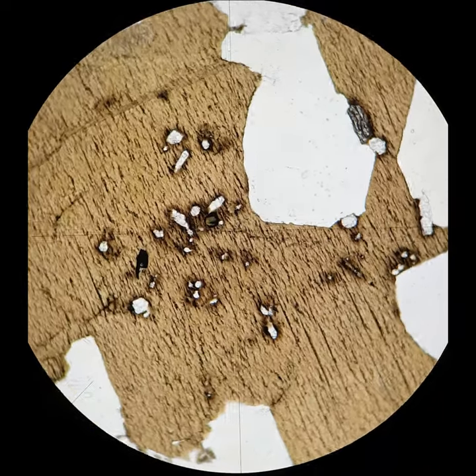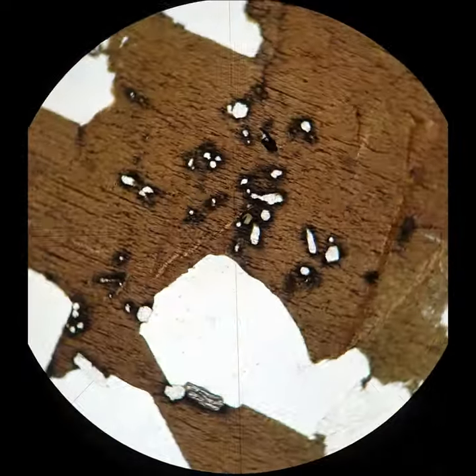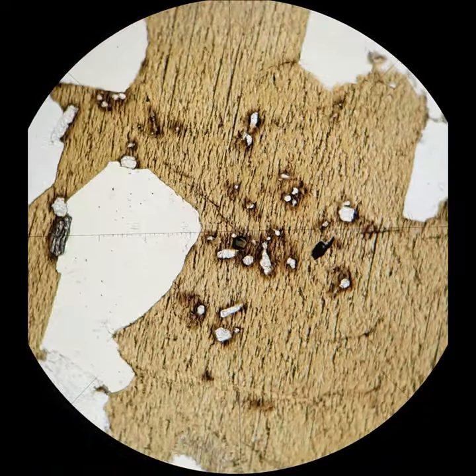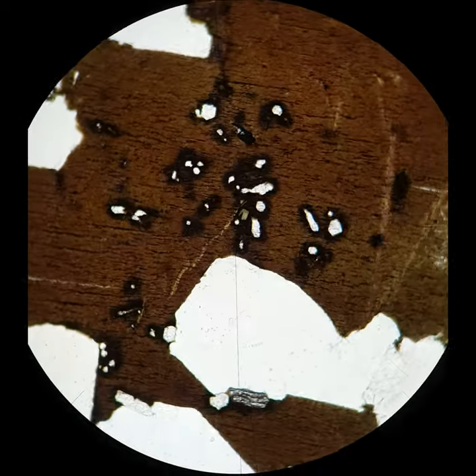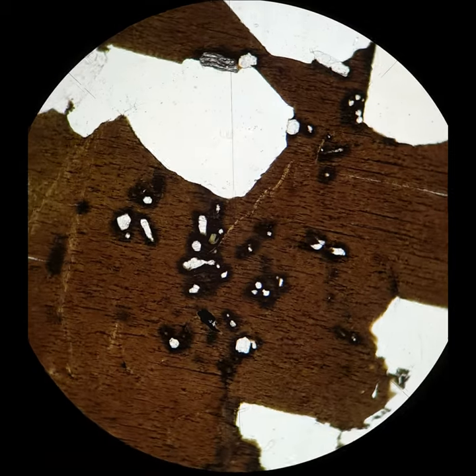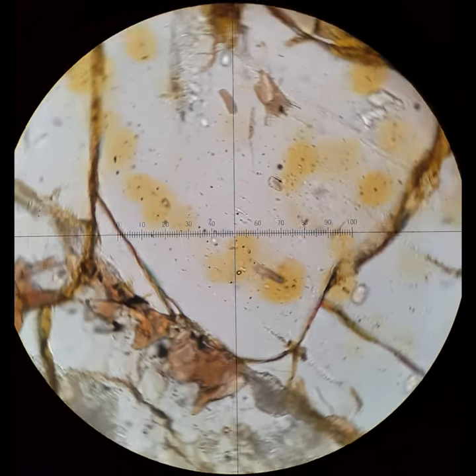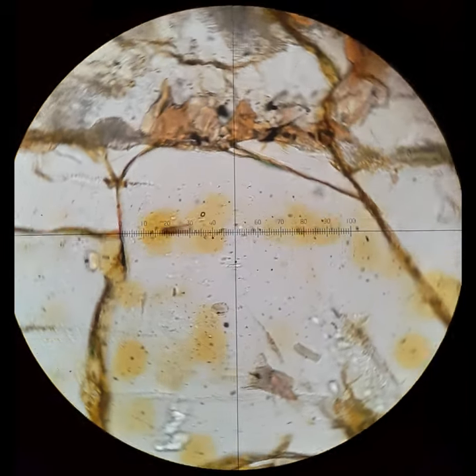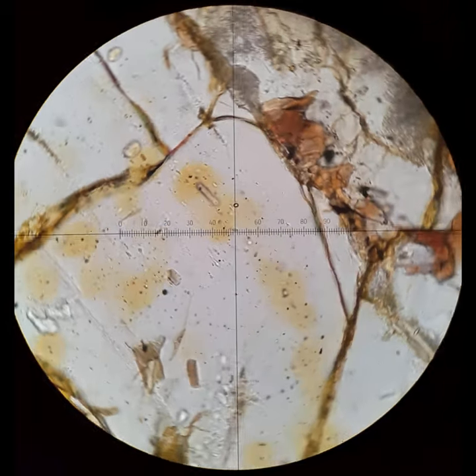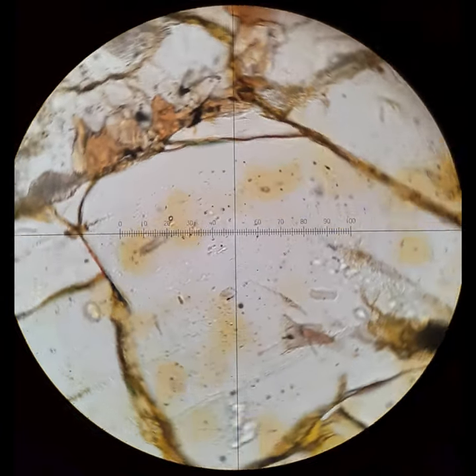Radiation damage in some minerals also causes pleochroic halos. The light dots in there are radioactive minerals. The darker halos around them are the radiation damage, and you can see that they are pleochroic as well — they vary in intensity. These radiation damage halos around radioactive inclusions in cordierite are one of the main ways that I identify this mineral, and these yellow pleochroic halos are especially distinctive.